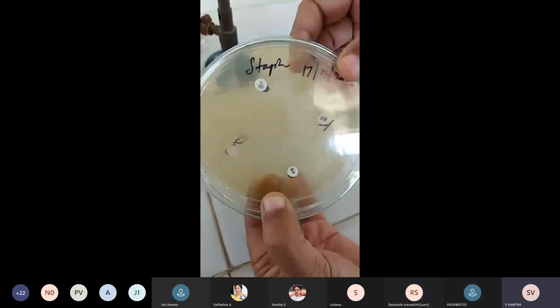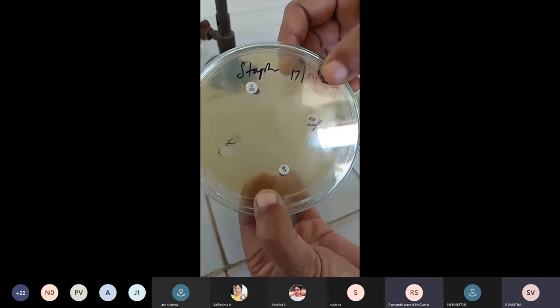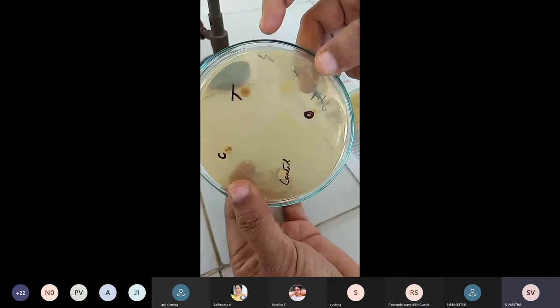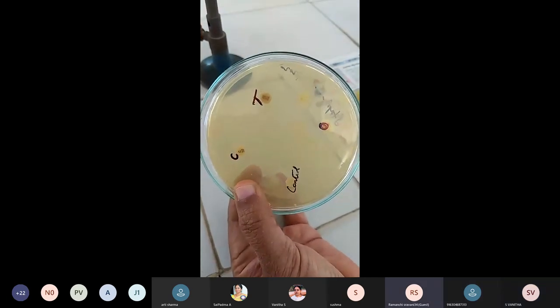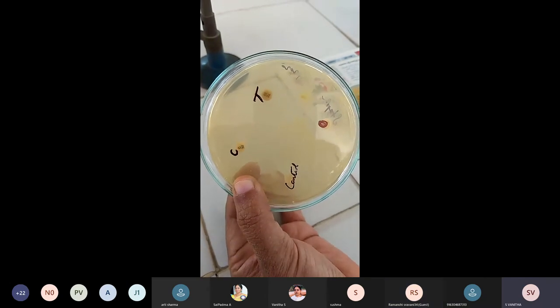What are you able to find here? Do you find any zone of inhibition in this sample? No, no ma'am. What is your conclusion? What is the conclusion of this experiment? The organism is resistant here.